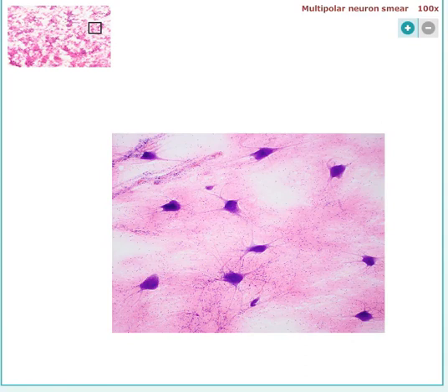So we are now going to talk about nervous tissue. Friendly reminder once more, there are 4 types of tissue. Histology is the study of tissue. The 4 types of tissue are epithelial tissue, which we've already done, connective tissue, muscle tissue, and we're going to do the last one, which is nervous tissue.